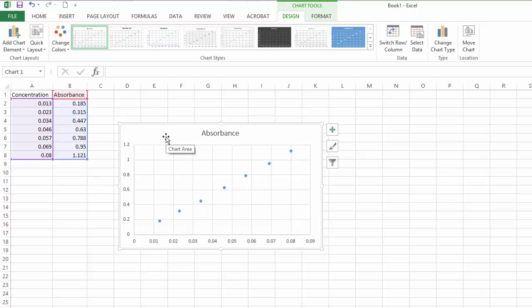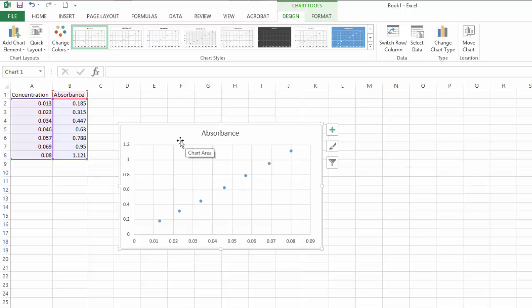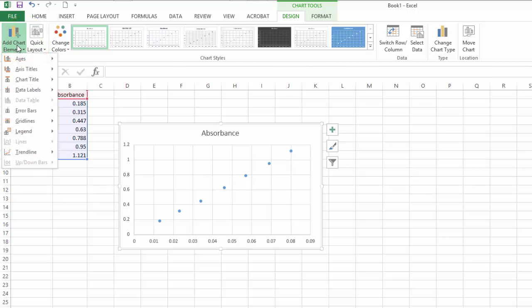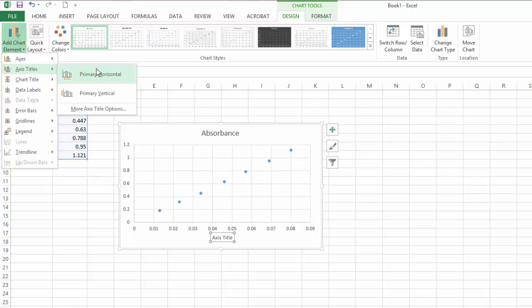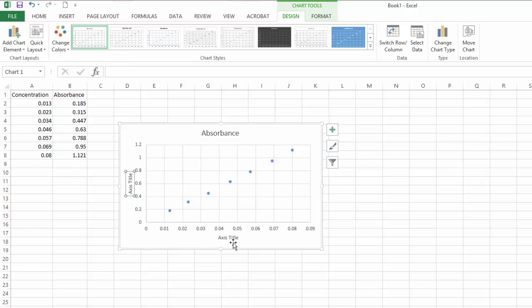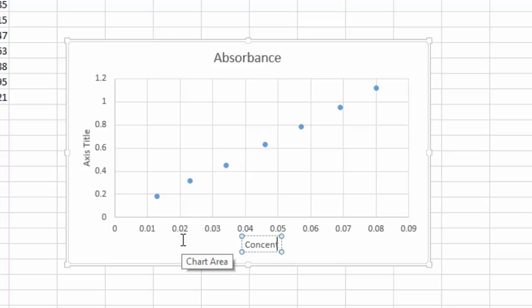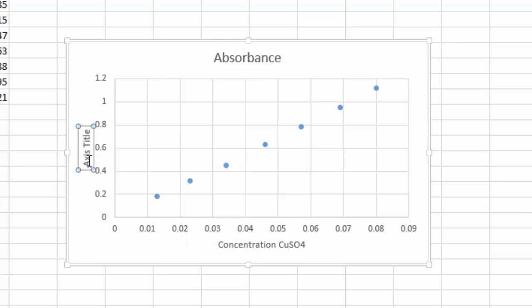I'm going to add some axis titles. You can either go into Quick Layout if that's available, or go into Add Chart Element and go to Axis Titles to add those in. My x-axis title is 'Concentration of Copper Sulfate' and the y-axis title is 'Absorbance'.